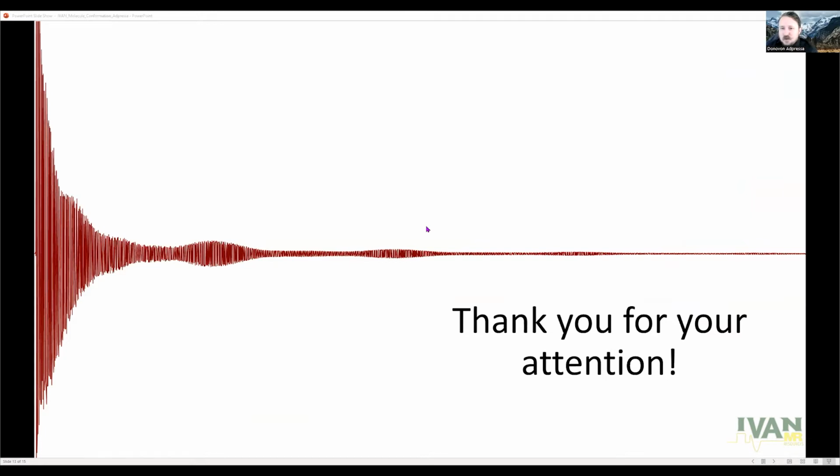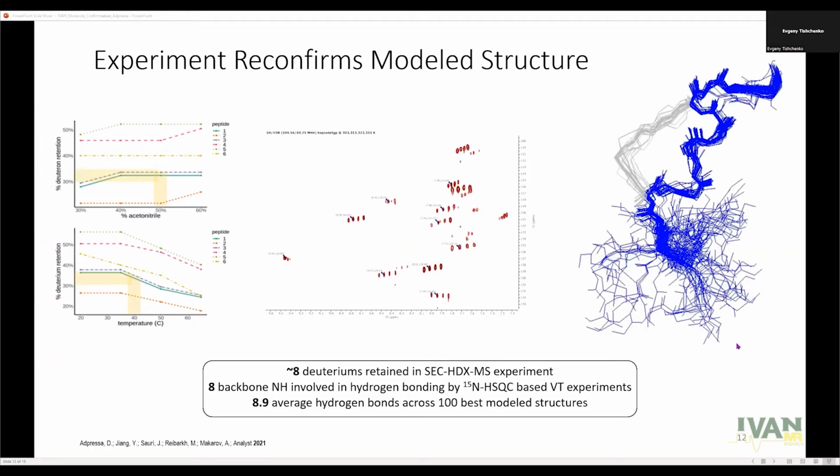You should note a Prodigy cryoprobe too. Maybe that's a... I have a question on that subject. It's Evgeny Tishenko from JEOL, USA. Since we mentioned hydrogen bonds and 15N HSQC, it looks like your peptide is relatively small, concentration is relatively high, and probes are relatively sensitive. So there is a chance to try an experiment that gets through hydrogen bond J couplings: nitrogen, carbon, proton, carbon, proton, nitrogen. I certainly tried very hard using SOFAST HMBC to see if I could get through hydrogen bond couplings. I don't think it's possible for this molecule without labeling. Okay, fair enough.